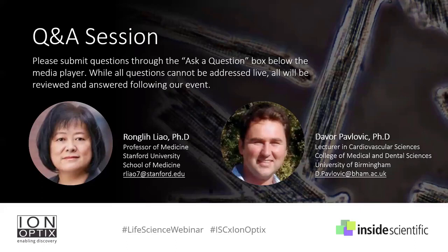And Davor, do you have anything to add to that? No, I think that's absolutely right. Everything that Rongli has said, that's exactly what we would think is the best way to judge it. And possibly just, I know Rongli mentioned this previously to me, is to try and pace them. If they can follow pacing, that means they tend to be of good quality.